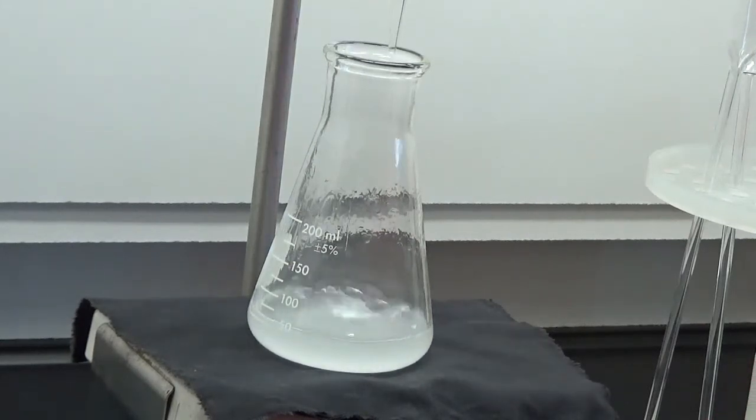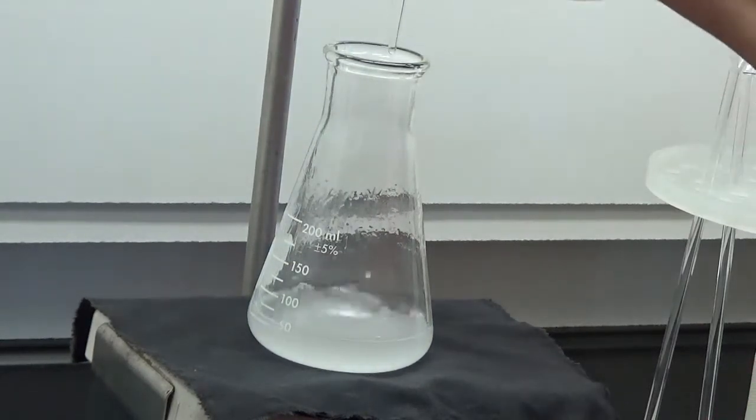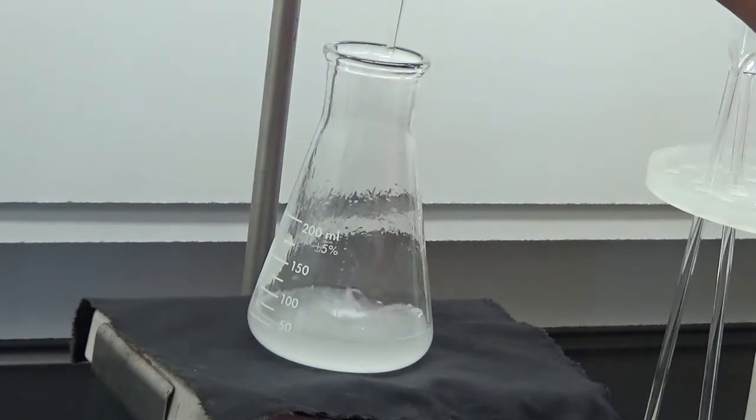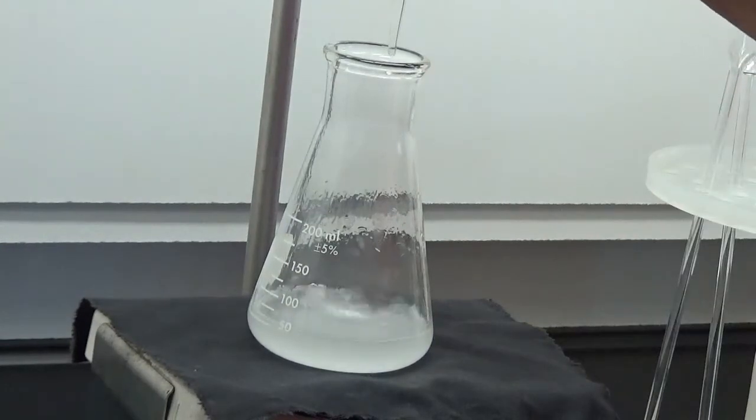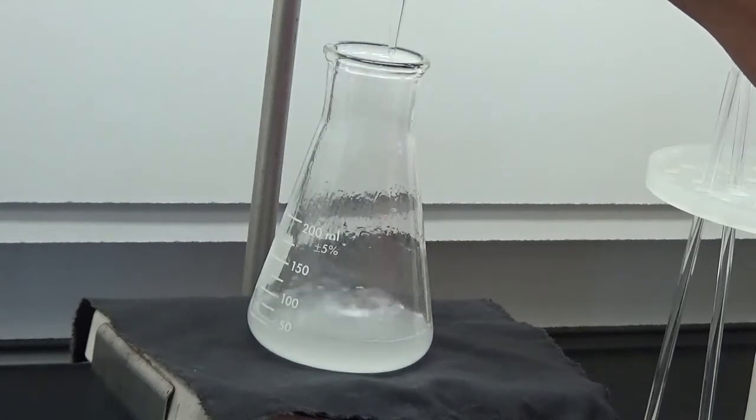Quick drops. Let it stir. Another. Just going to let it go slow. One. So it's just dripping very slowly, continuously. Got to go a little faster.